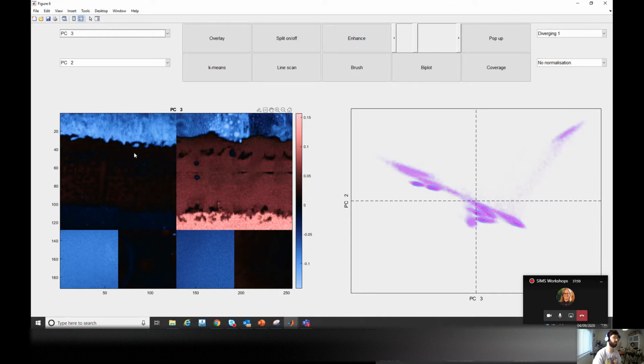So, for example, the negative stuff, remember we're always checking the color checker at the bottom. The negative stuff is correlating to only these two references. So you can see it's black for this one and this one, meaning that it's not related to PC3 negative or positive for that matter.